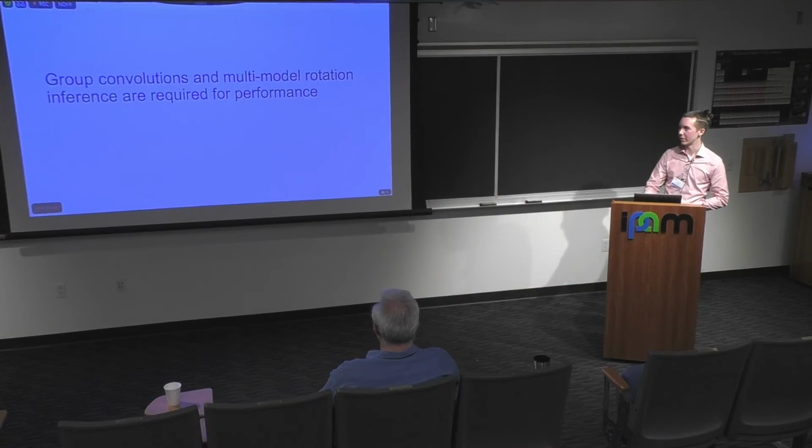But maybe it's because those things are close enough, and so it's okay if it ends up getting encoded into a slightly different conformation of the protein, but it's close enough and it averages out in the end or something. It's not sure. But it probably does impact the convergence speed of the network, right? You could imagine that if you were doing that inference better, you probably would converge much faster in training the decoder.